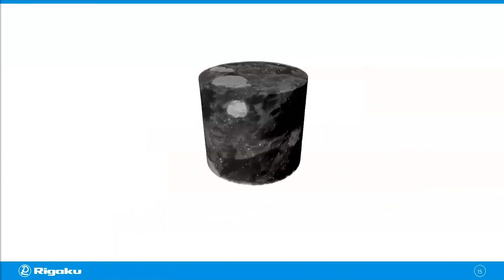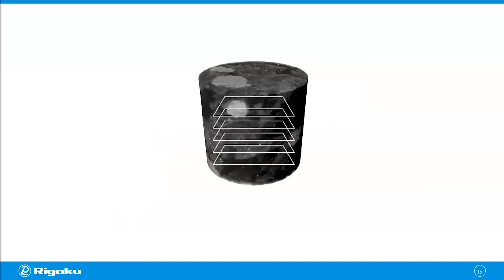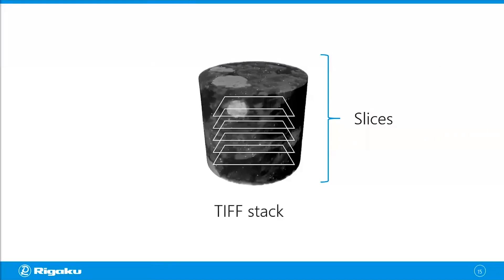File-structure wise, the volume is saved as multiple 2D slices stacked on top of each other to create the 3D information. This is why CT scans are often referred to as TIFF stacks. Now let's take a look at one of those slices.